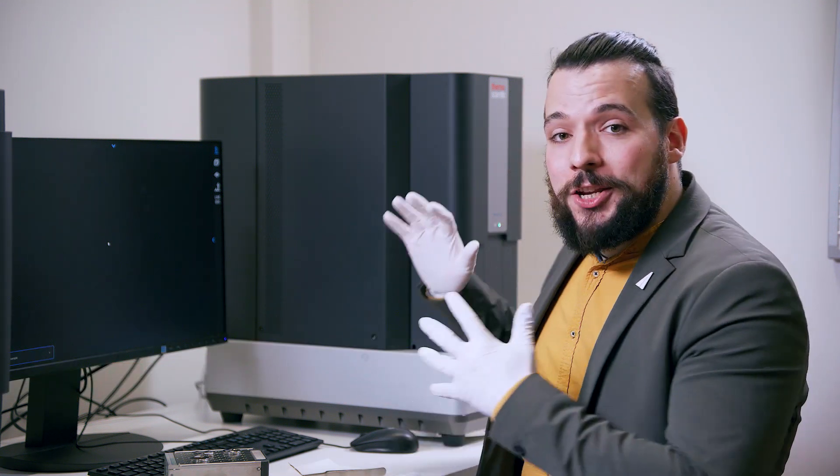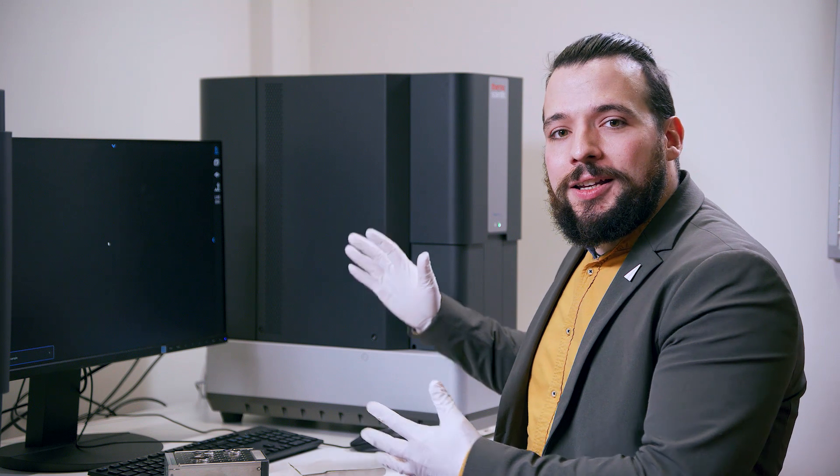Thanks for tuning in to our video demo of the Thermo Scientific Phenom XL Generation 2. I am Luigi and we are at the Phenom headquarters in Eindhoven, and this is the Phenom XL.